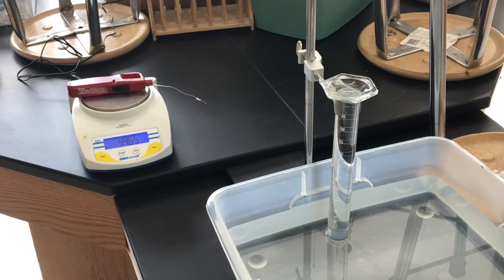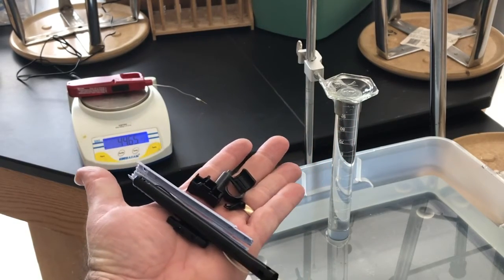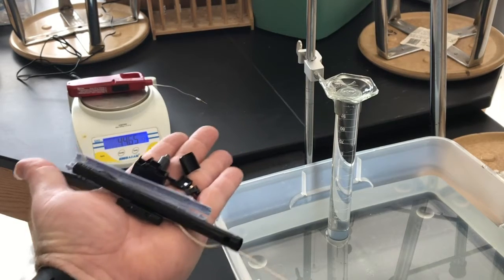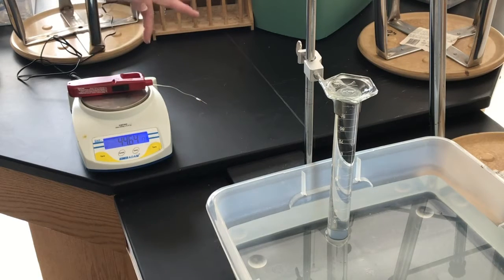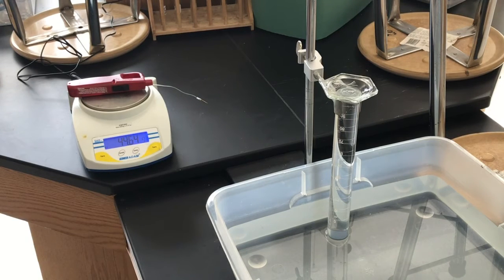All right, let's look at the rest of the setup here. What I have done is I have taken apart a little aim flame, a lighter, like a camp lighter or whatever you might call it. Aim flame is what I call it. So here's the rest of the pieces, but basically all I really wanted is what's on the balance over here. I've got the tank of fuel, which is butane, and I've got the trigger here that releases fuel out the little tube right here. The reason I have it on the balance is I want to get a reading of the mass before we get started, and it looks like it is 44.64 grams.